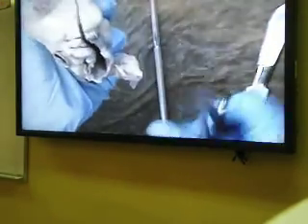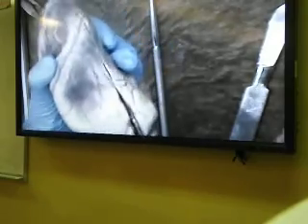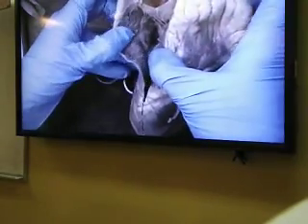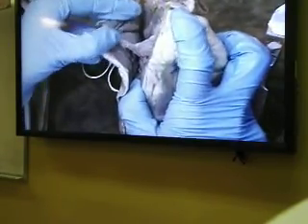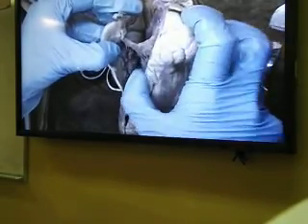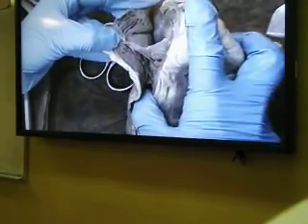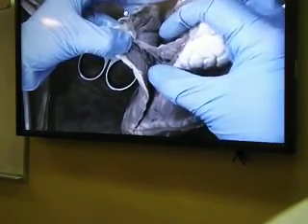And you can take this off. Just loosen this area a little bit one more time, and that's good enough. Okay, and I open the right side. The whole idea of doing this, I want to see how the valves are located before I cut through the valve, because unless I cut through the valve, I will not be able to see how valves are located between the atria and ventricle. But this way it's showing me how the tricuspid valve is located.